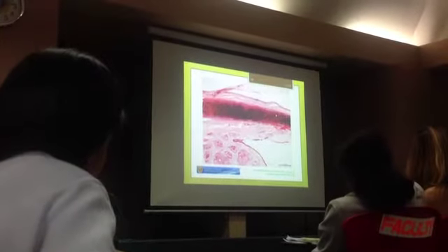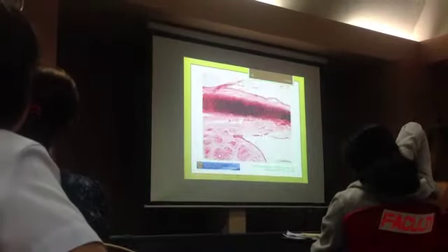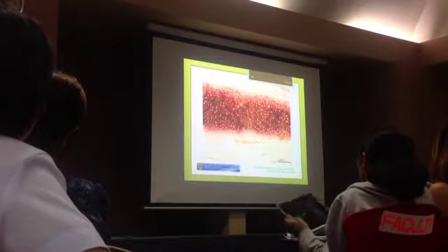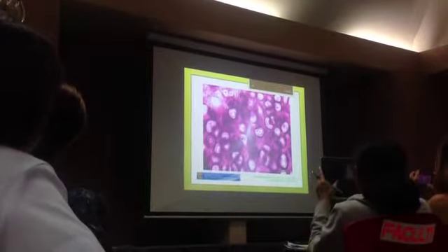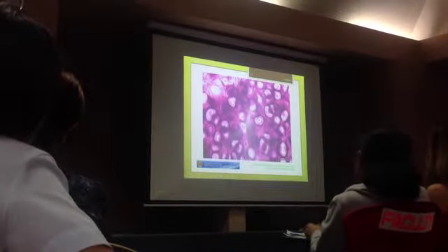Classify pointed tissue, be specific. That's the high power. Stain with elastic stain.